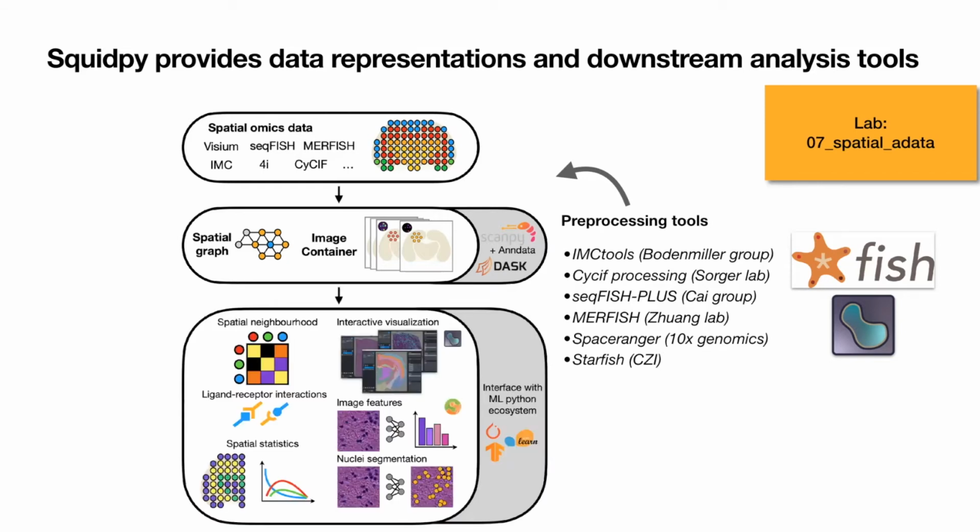Right. Downstream of these representations, once we have our spatial data in either a graph or an image container, there are a lot of different analysis tools that we provide with Squidpy, and we continuously aim to extend this as more and more tools come up. With spatial data in general, the challenge, but also the nice thing, is that it's a very open field, and there are not a lot of established best practice methods at the moment for this analysis.